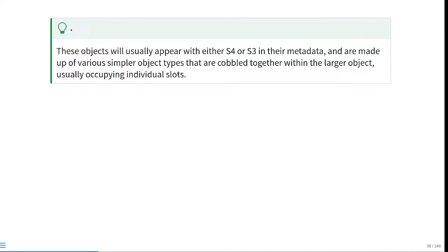Versus if you look at some of the tidyverse packages, they may use a different format, which is called S3. The focus as far as the difference of those two is not anything you're going to be concerned about for the vast majority of this course.